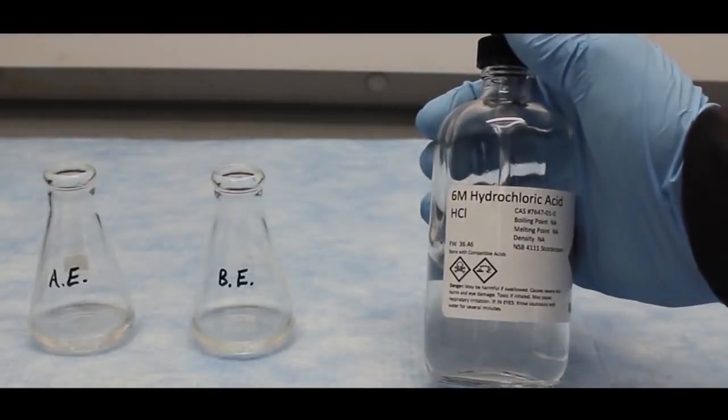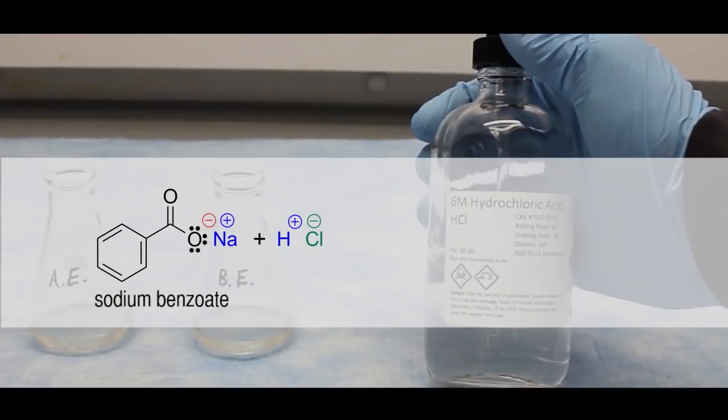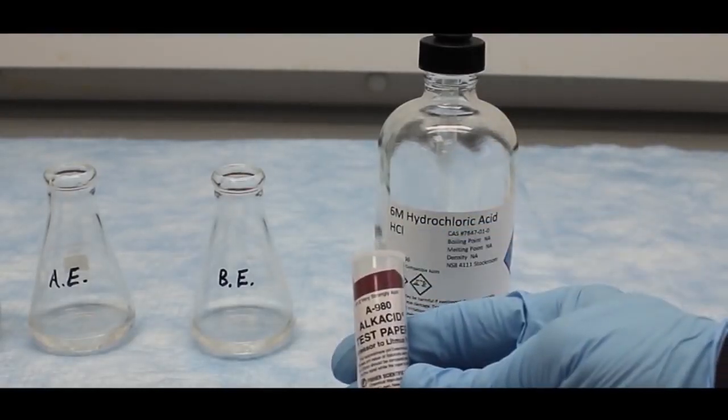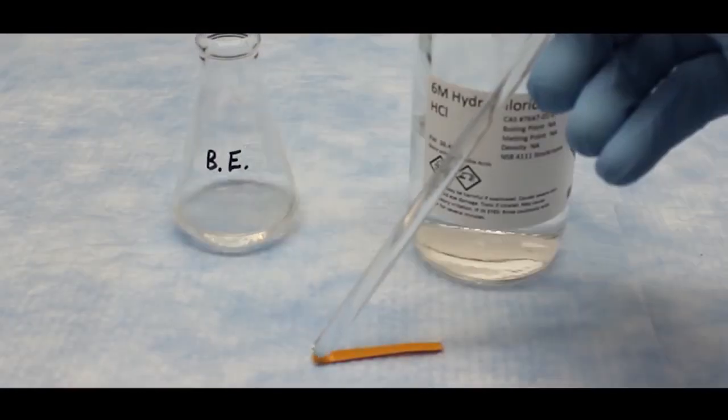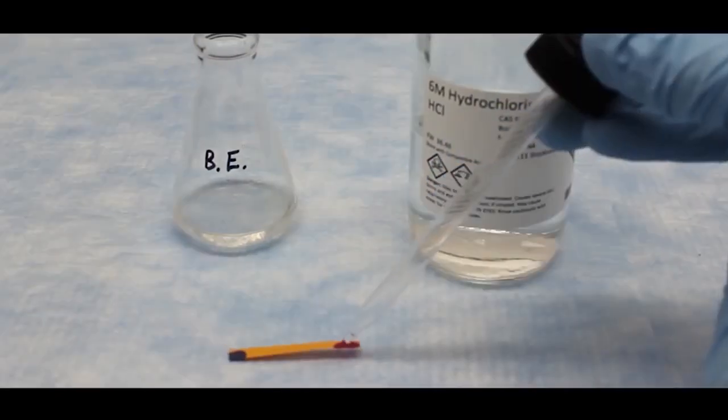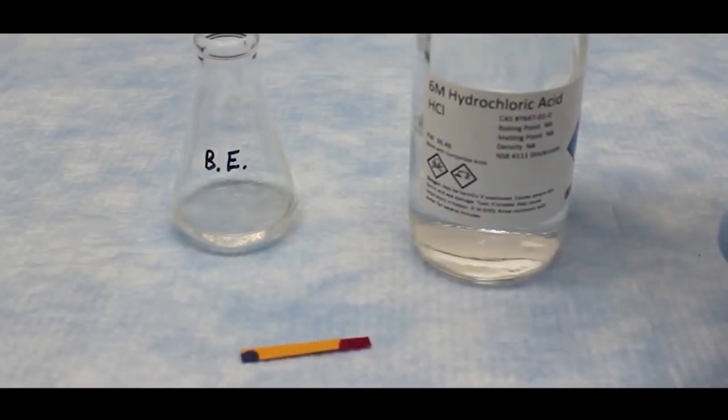Next, I will add 6 molar HCl solution to the basic extract, which will protonate the sodium benzoate, converting it back to the benzoic acid. I will monitor the pH of the solution to ensure the protonation occurs. Right now the basic extract has a pH of about 10, and the 6 molar HCl has a pH of about 2. I will know the protonation is complete when the basic extract also has a pH of about 2.